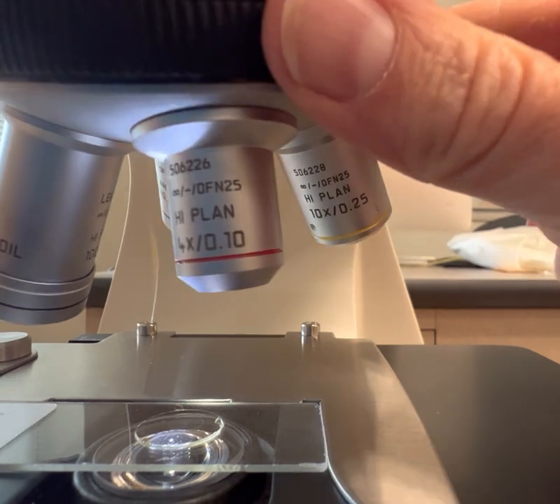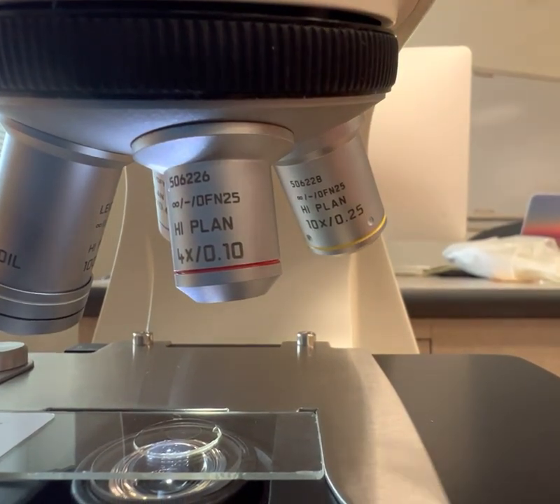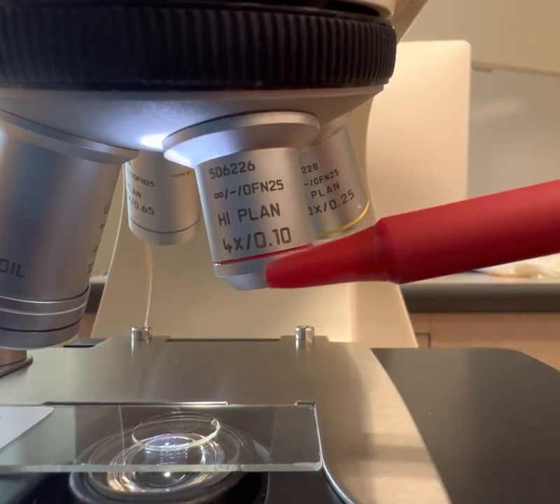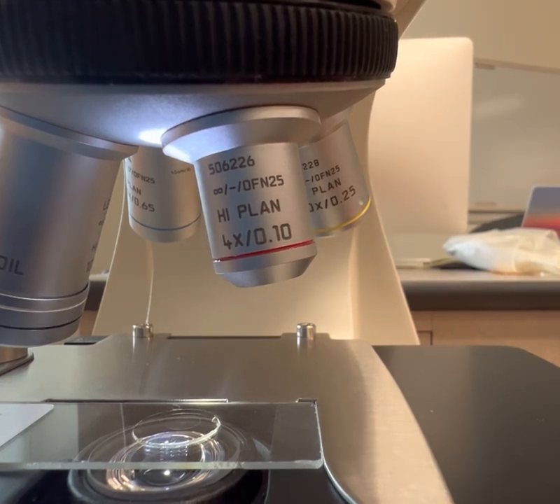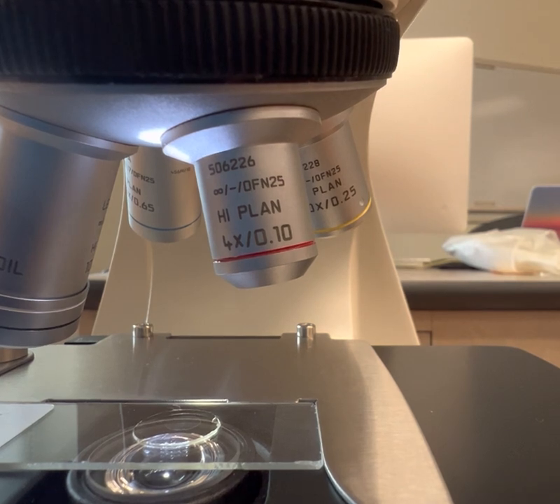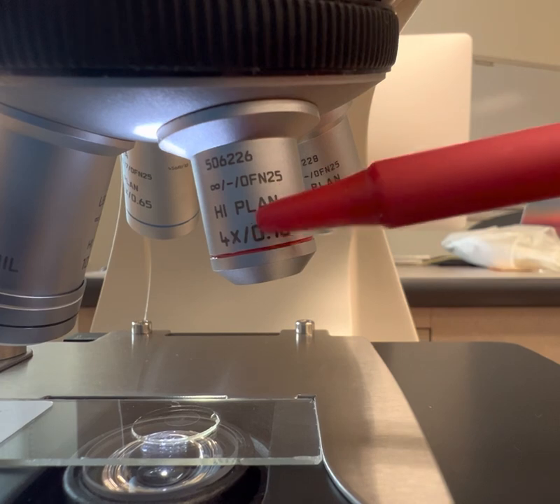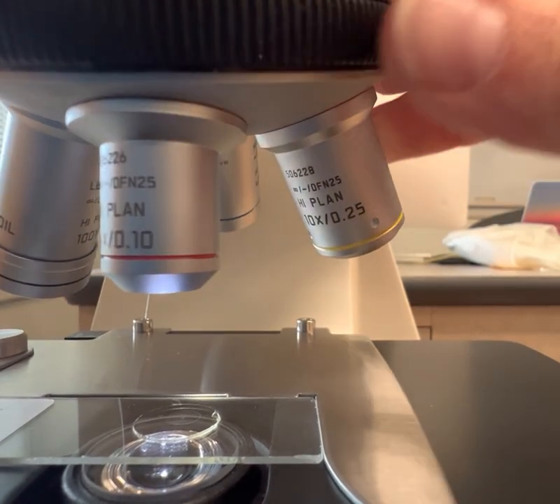But if you look at it, all of these objectives are held right here. This is the nose piece. Here is my scanning objective. Look, you can see that little number 4. So there is 4 times the naked eye magnification with this objective right here. So if I used this objective and looked through my oculars up above, I'd have a total of 4 times 10, a total magnification of 40 using scanning power. Always start on scanning power when you're looking at something because it has a really big field of view.